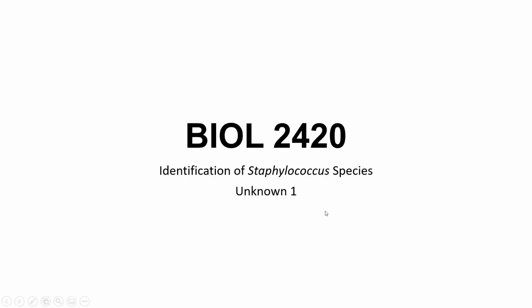Okay, so this video is to train you on how to identify an unknown staph species and really familiarize you with the biochemical tests that would be common for a suspected staph infection. So I'm going to walk you through unknown 1 and show you how to read the tests, and then I have 2 practice PowerPoints, and then you can check your answers in the module.